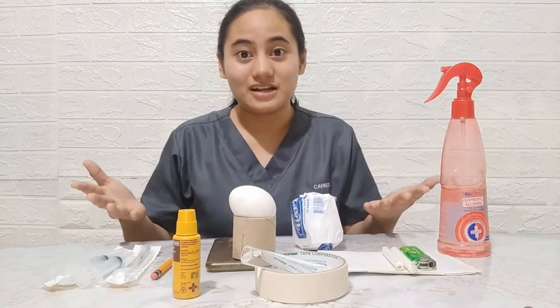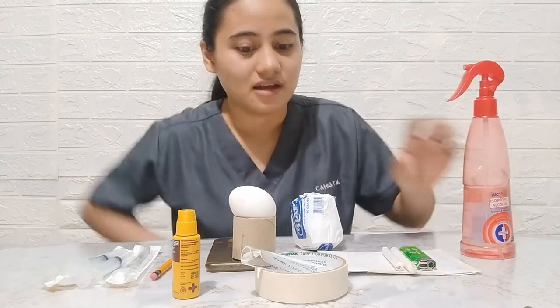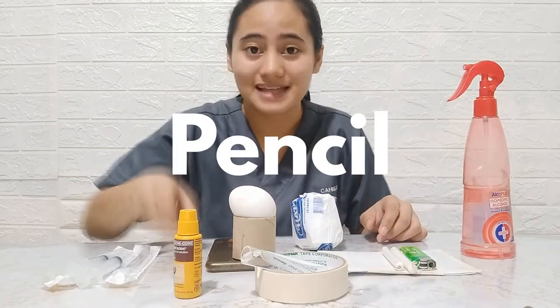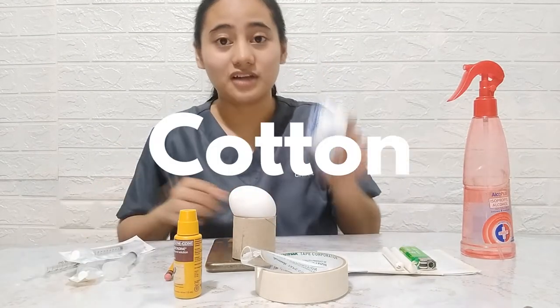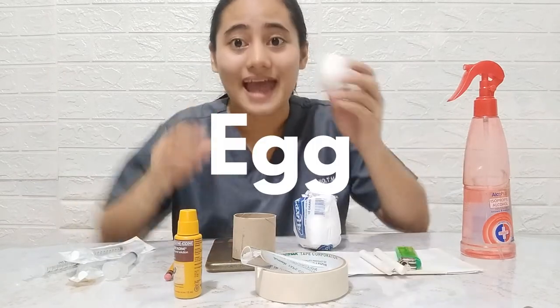These are the materials needed. First, alcohol, betadine, pencil, syringes, cotton, candle and lighter, and egg.